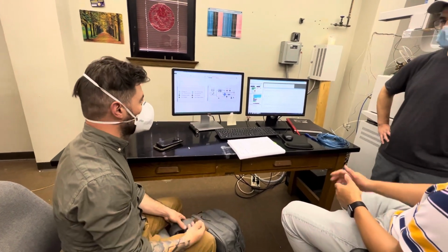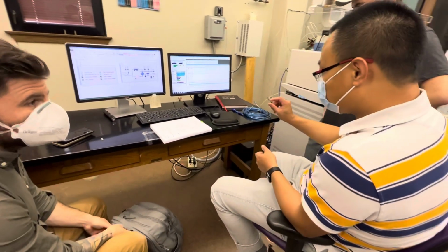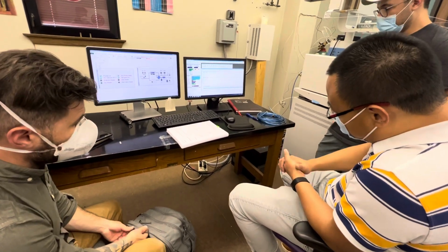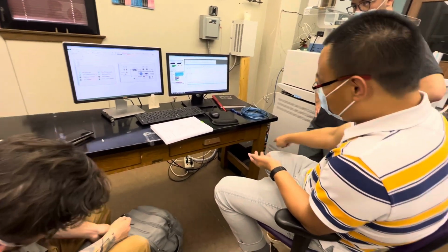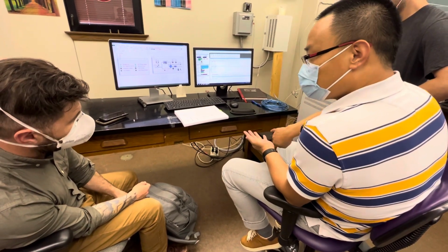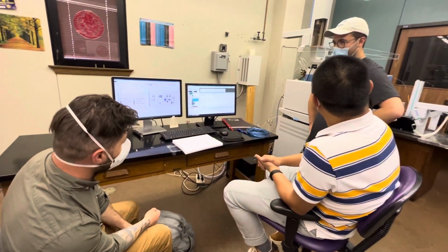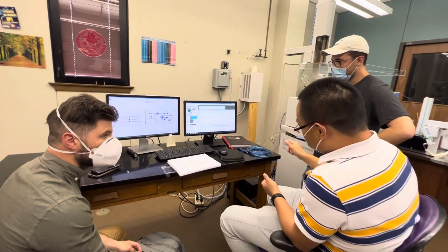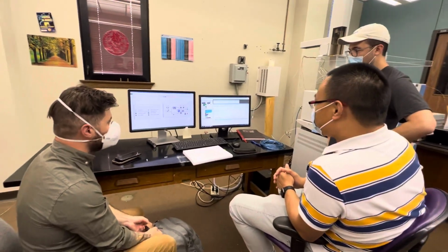I see people just plug in something so they can do a daily backup, right? Pen drive? Like it automatically loads it up. But this one has 2 hard drives. So this computer has parallel hard drives. It copies everything onto the second one automatically. Yeah, that's nice. But for sure we also make a copy. Maybe I need to buy a PC that we can put somewhere, and we can copy or put data over there.